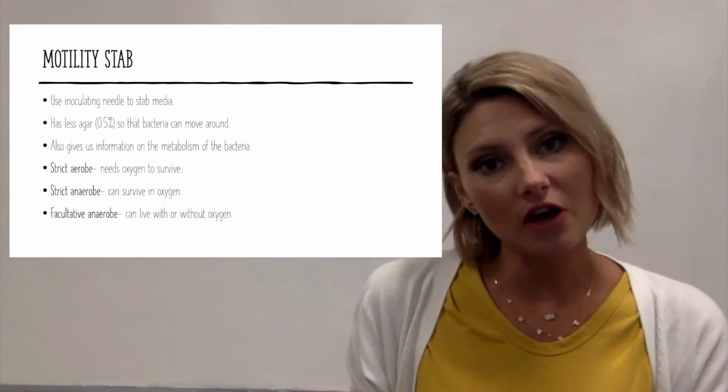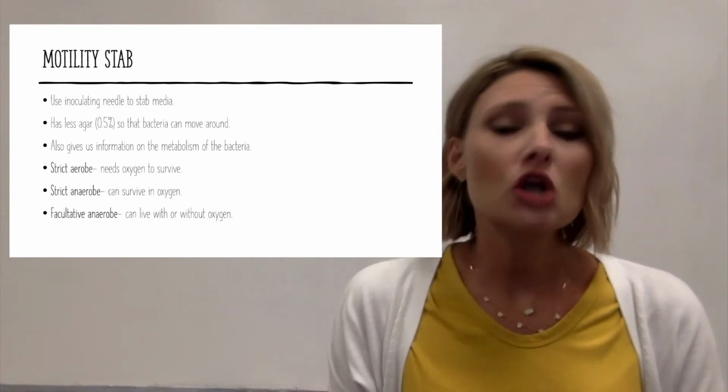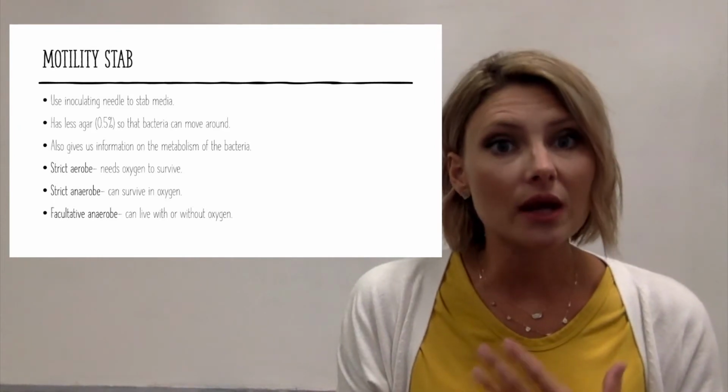So motility agar has a third of that. It only has 0.5% agar in it. So it's more liquidy, so it's less dense.